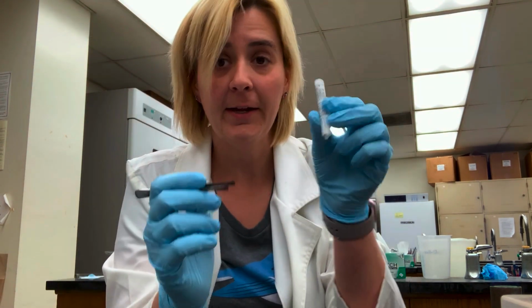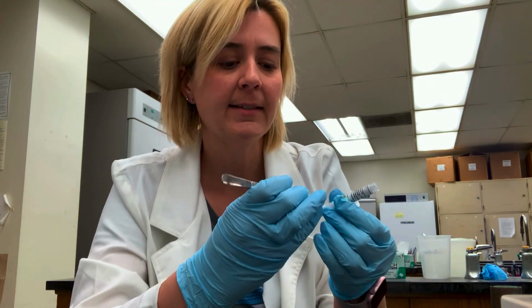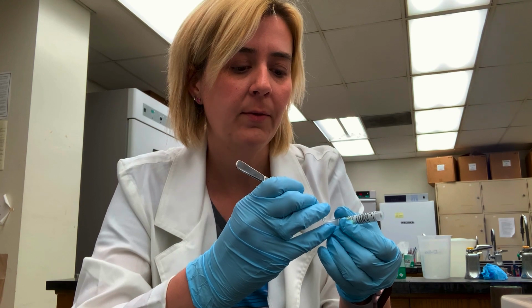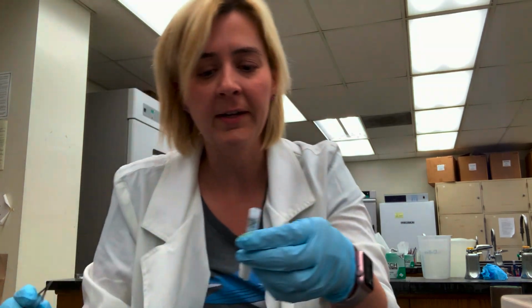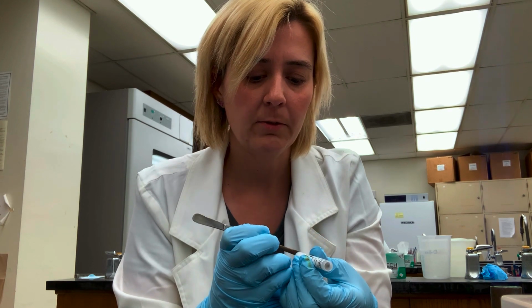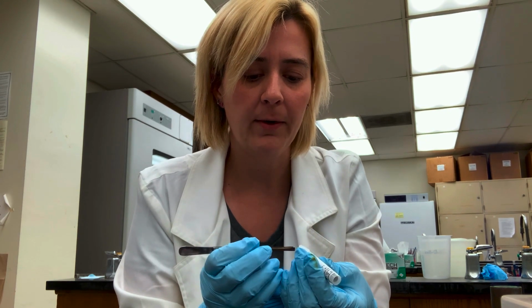The next antibiotic I'm going to select is ceftriaxone. So ceftriaxone, I will pull the disc, putting it on the plate, pushing down like I showed you. And the final antibiotic I'm going to choose for this is bacitracin. So bacitracin, pop out the disc and put it on the plate.